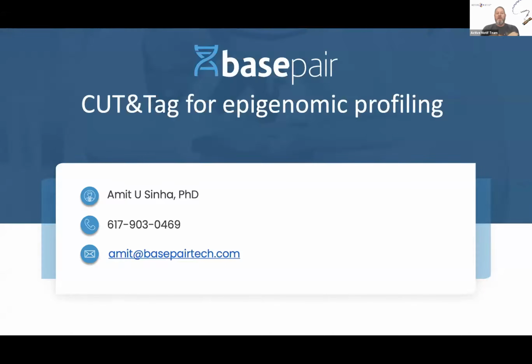We're going to move on to the second section of our webinar with Dr. Amit Sinha. He's the CEO, founder, and head of bioinformatics of Basepair. His talk will focus on how Basepair has developed bioinformatic pipelines that use the next-gen sequencing data that Sarantis was talking about, from techniques like CUT&Tag and ChIP-Seq, to enable their users to process, analyze, and interpret data using advanced analysis software. Thank you so much for being a part of this webinar, Dr. Sinha, and we're excited to hear what you have to say.